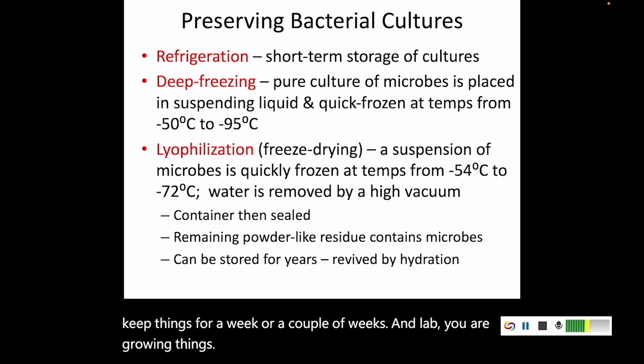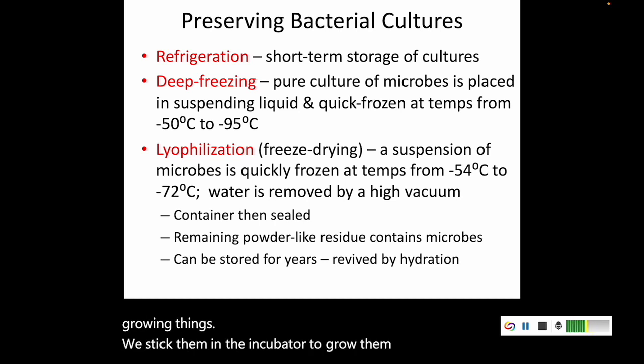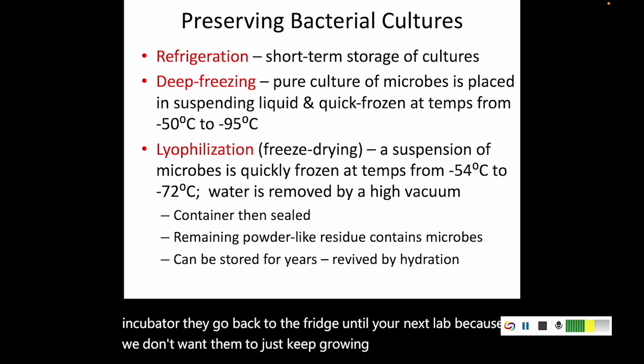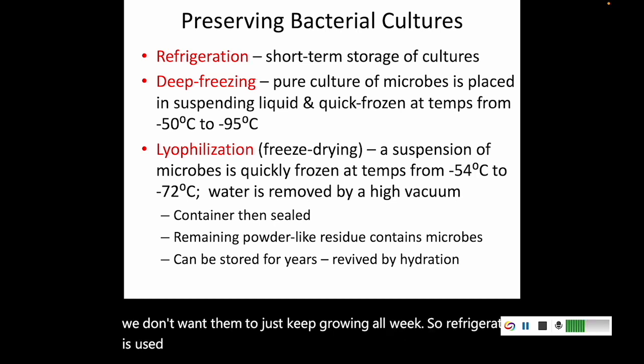We stick them in the incubator to grow them. And then from the incubator, they go back to the fridge until your next lab because we don't want them to just keep growing all week. So refrigeration is used for short term.